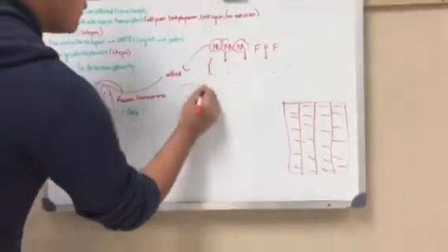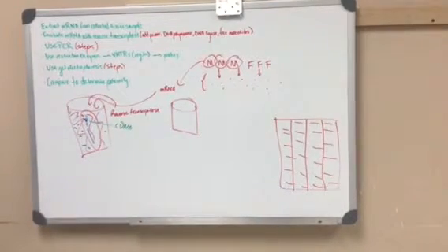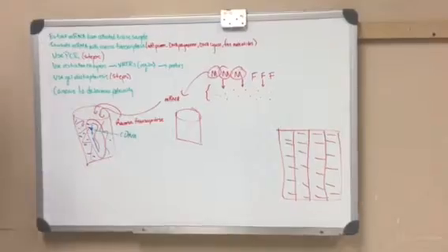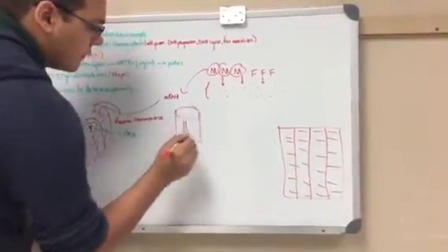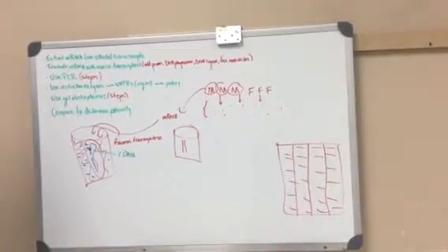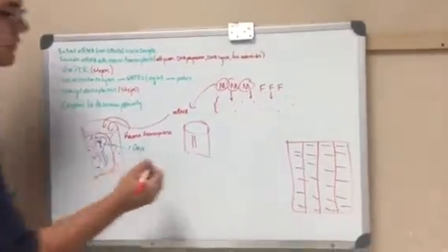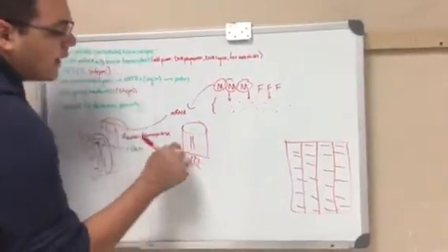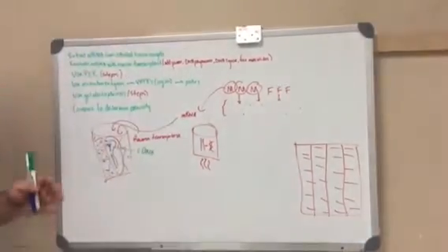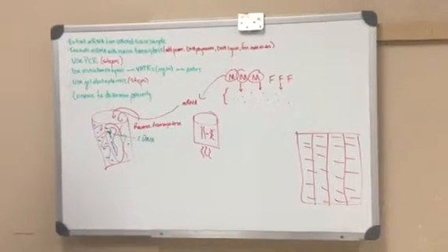And PCR is its own little complex process. Polymerase chain reaction, that's what PCR stands for. So we're going to have the 2 strands, and they're not usually separated, but I'll explain why I drew them separated there. The first process is denaturation. Basically we heat up the solution, and so instead of intertwining, they become separated because we want to separate the DNA strands. And then after that, we have to cool it.